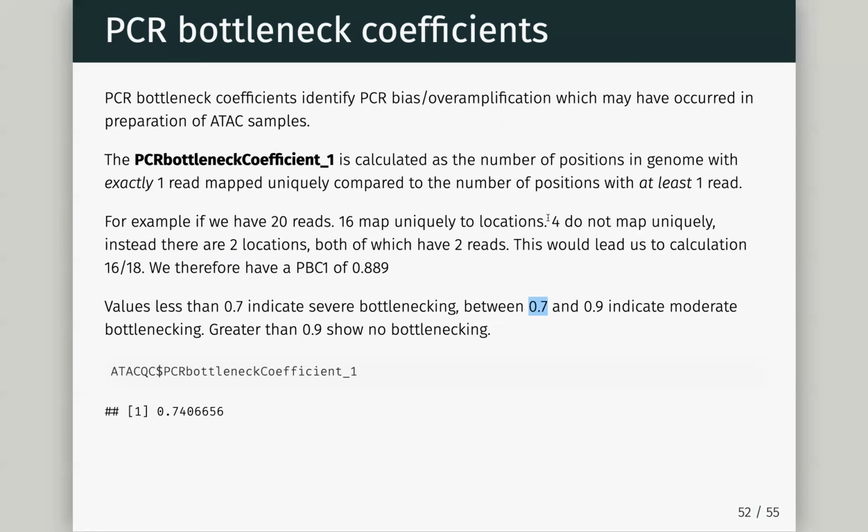If you can imagine you have a 36 base pair read on each strand, it means the maximum height you could have before you're a duplicate is 72. And that limiting the maximum range of your signal became a real problem for differential ATACseq and differential ChIPseq. You just have a max, and then another one's still the max, but it's actually way higher since we removed duplicates. So there's not much you can do to clean it up, but if you had a sample which fell below this, I would start to think about maybe rerunning that sample.